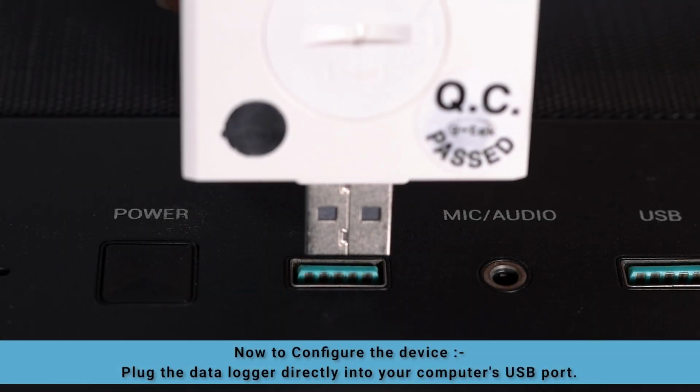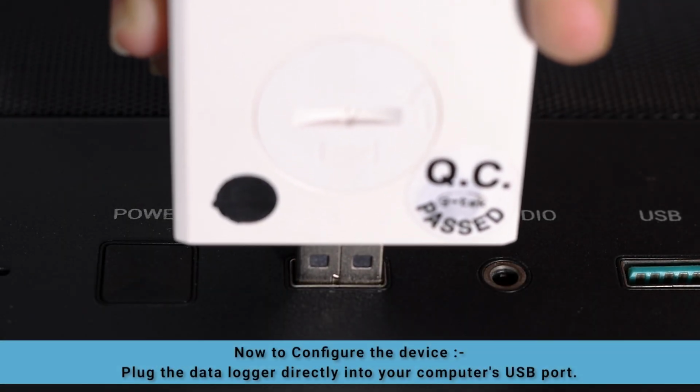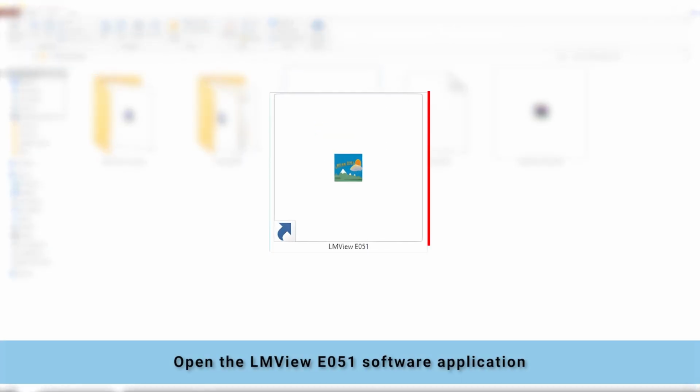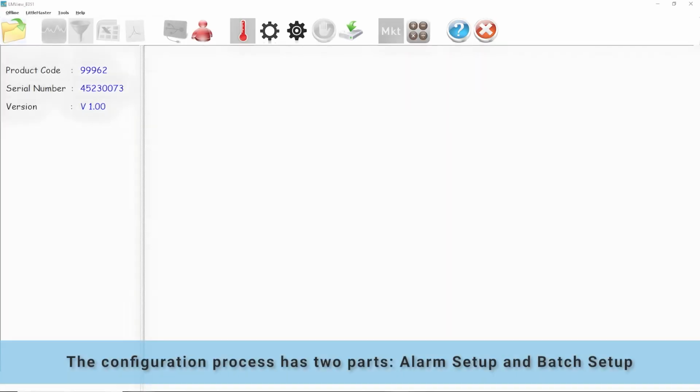Now, to configure the device, plug the data logger directly into your computer's USB port. Open the LM View-E051 software application. The configuration process has two parts: alarm setup and batch setup.